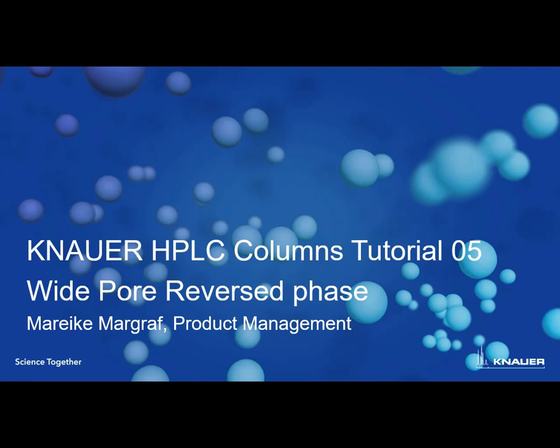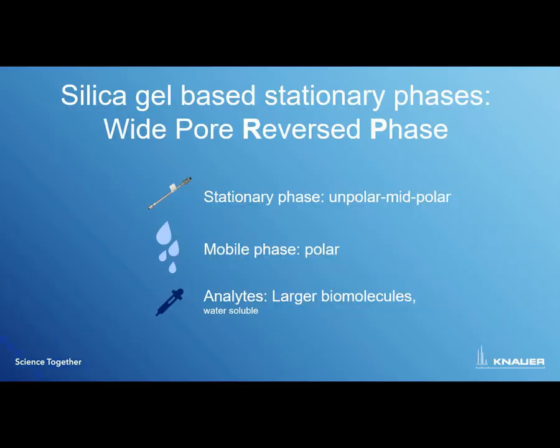Welcome to a KNAUER HPLC Columns tutorial with the topic widePore Reversed Phase Columns. We already talked a lot about reversed phase in one other tutorial, but there is a special case where you can use similar phases, also reversed phases, but with wide pores. And we will talk here about why they are so special and when we can use it.